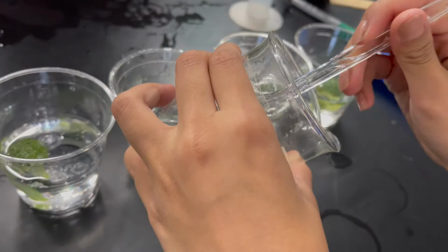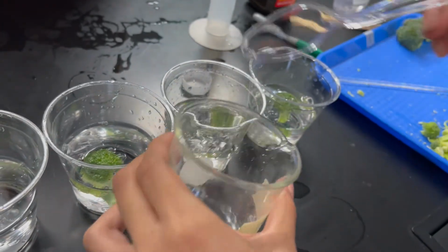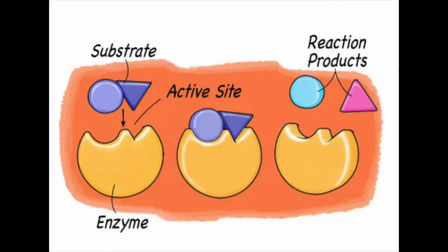Scientific American supports our hypothesis of this correlation because once you add more hydrogen peroxide to the solution, the reaction rate will increase as more substrate molecules can collide with the enzyme, forming more product. It is also important to note that although there is a general increase of solution height with hydrogen peroxide concentration, it wasn't a drastic change from each cup but fairly small.